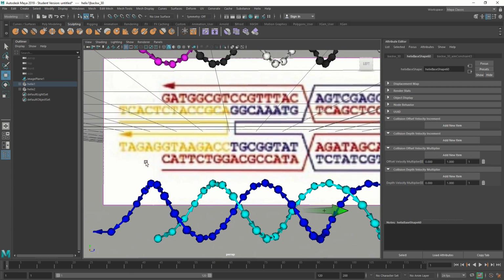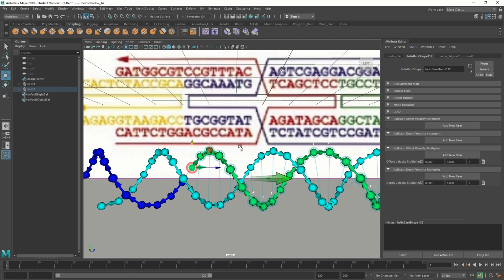So in this case, there's a 3' end that needs to have a nick after 13 nucleotides. So it's this one. So it's 1, 2, 3, 4, 5, 6, 7, 8, 9, 10, 11, 12, 13. In this case, I want the nick to be above the 13th base. So I have to actually select the 14th base when I'm counting backwards from the 3' end, and then do Helix, Disconnect Bases to get a fragment here that is 13 nucleotides long.